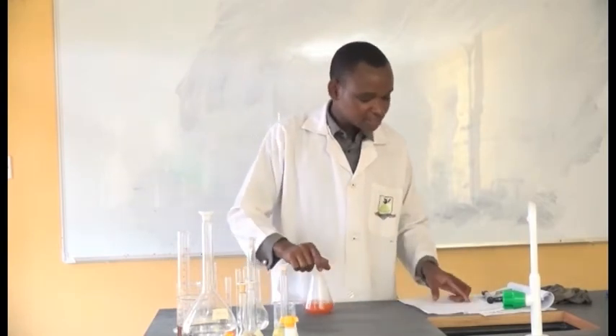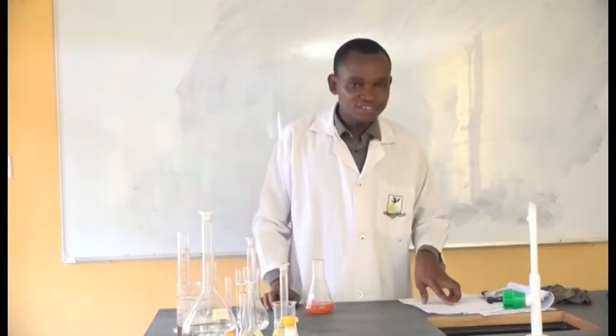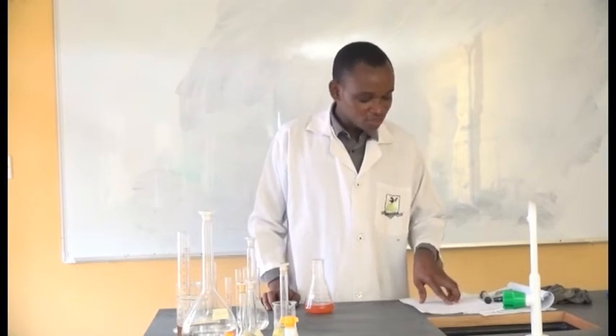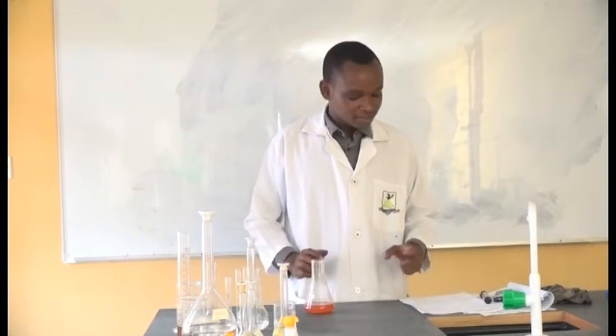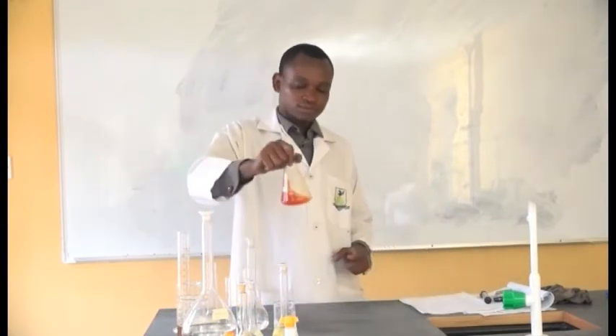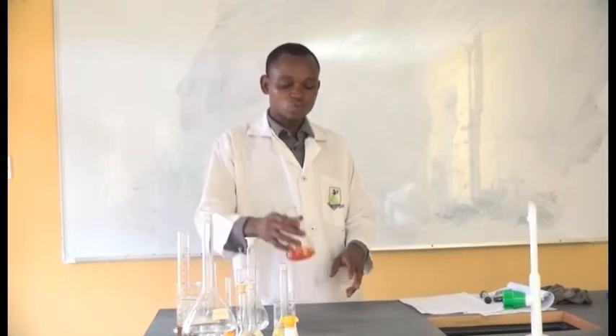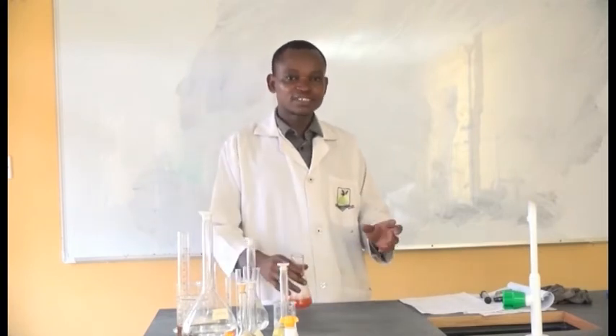The last step says titrate against sodium thiosulfate drop by drop until the endpoint, when you get a clear solution. So we are going to do the titration now, titrating what we have here against sodium thiosulfate.